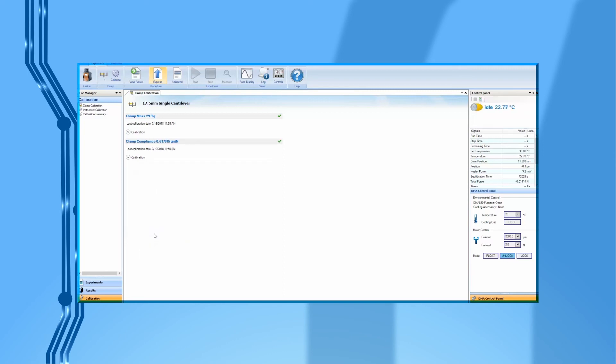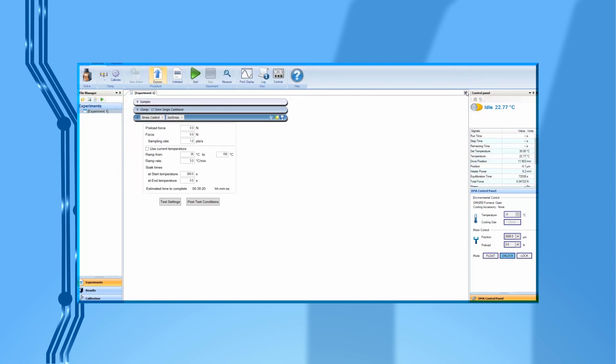When all calibrations are completed, you should see green check marks on each calibration step. Then, close this page in Trios. You are now ready to use this clamp.